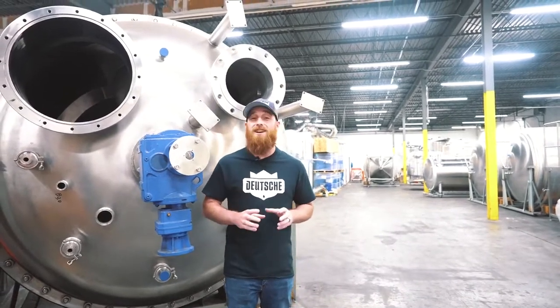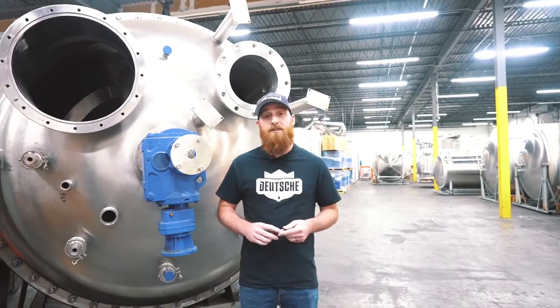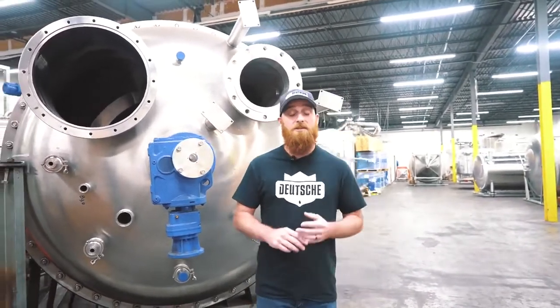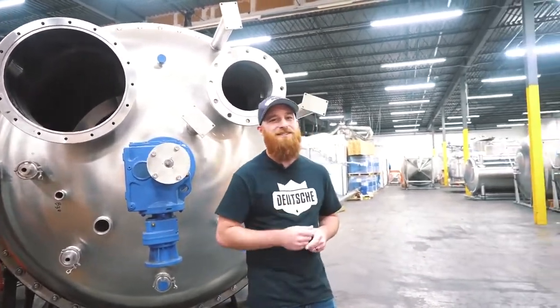Behind me you can see our Rotex extraction vessel, which can comfortably chew through and process about 500 pounds of biomass an hour. We have everything from extraction systems, winterization, post-processing candy kettles — you name it, we got it. However, today we're going to be talking about our short path distillation unit.